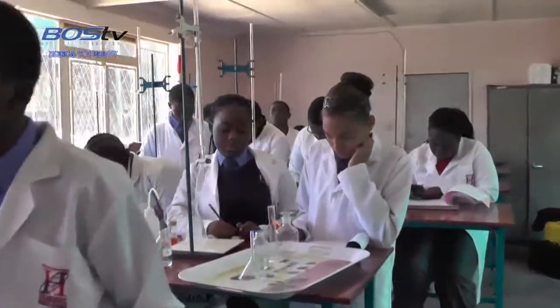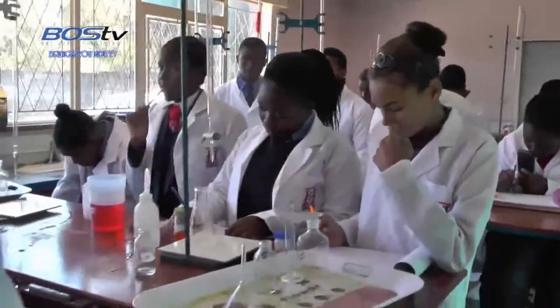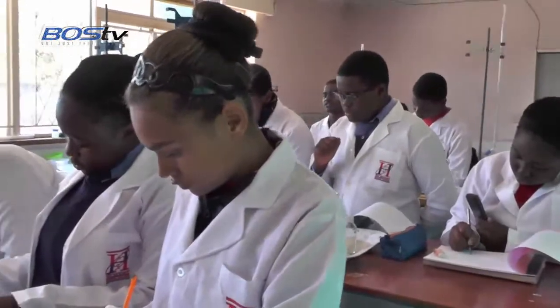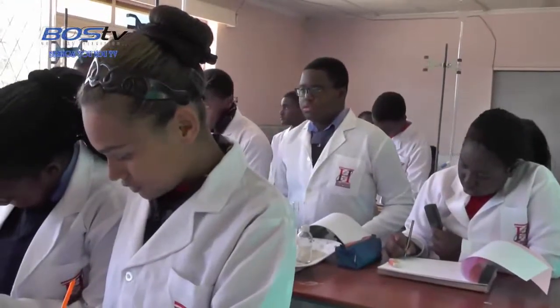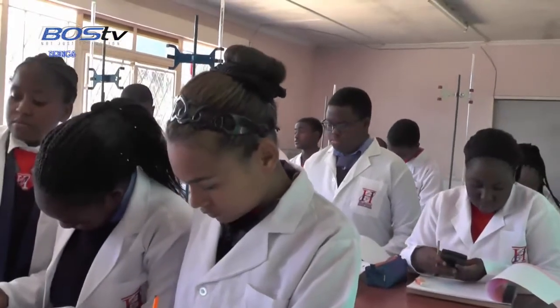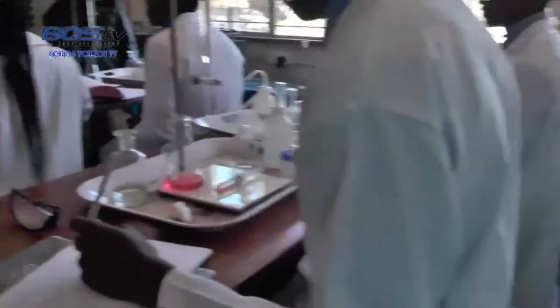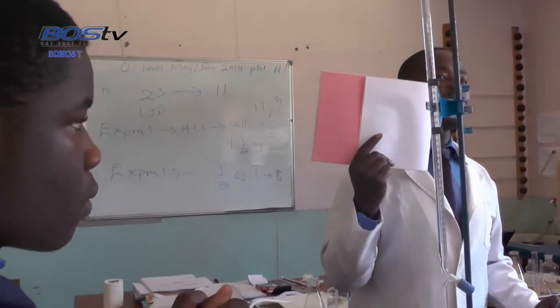Suggest a practical problem that would occur when carrying out these experiments and how you could solve this problem. Contamination of your reagents, correct. Who else? Which other problem can you think of? Inaccurate readings. For example, you can have a parallax error if you don't read the level at eye level. What else can be a problem? The one which was common for the bulk of you: the use of indicators. In noting endpoints, most of you overshot the endpoint. So it's another problem that can be encountered.